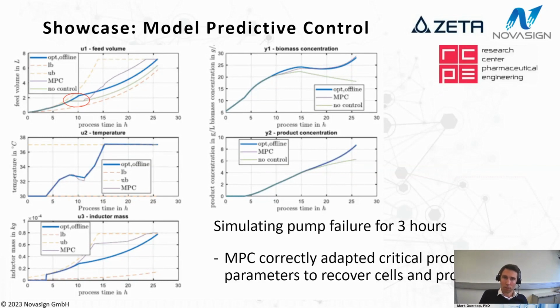So we use it for learning, we train faster, we find our optimum faster, and afterwards we take it for process control and monitoring. And this is basically the ultimate test for something like that, to say, okay, we have a change. What can we basically do?